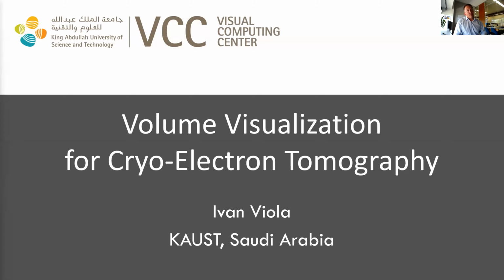Today, I would like to talk about the topic which we have recently started at KAUST, and the trigger was a collaboration with Tsinghua University, who actually have been working on the tomographic acquisition of the SARS-CoV-2 specimen. And based on their data, we have realized that we need to engage in some new research in volume visualization, with particular focus on the cryo-electron tomography, Cryo-ET.